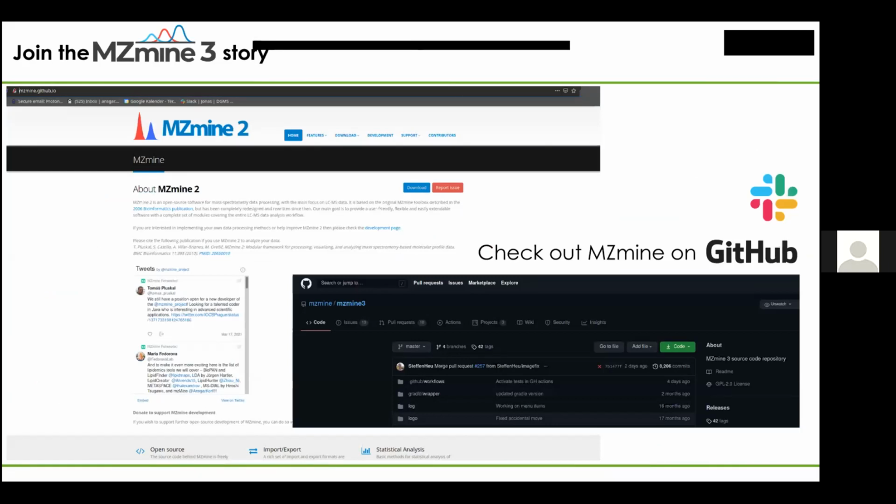With this slide, I'd like to show you where you can find MZmine. You can find it online at mzmine.github.io, and you can simply download the latest release version of MZmine 2 there. It's really easy to start. There's no installation needed. You can run it on all three mentioned operating systems.